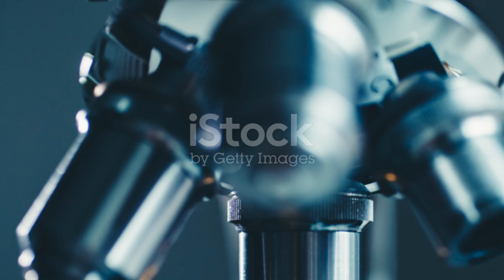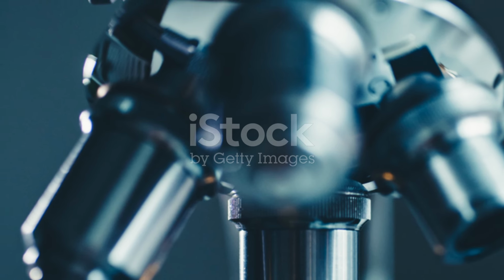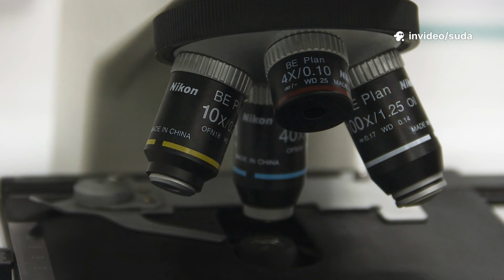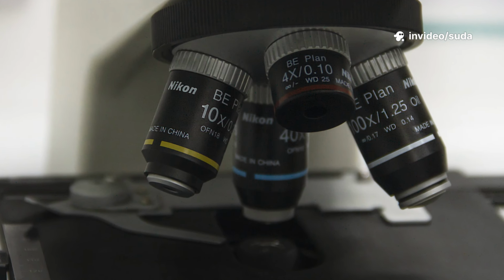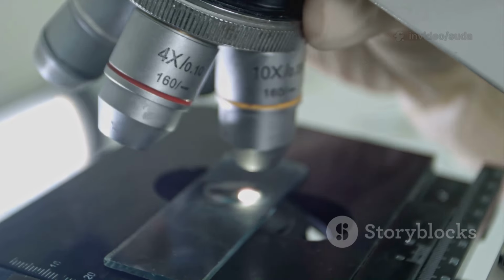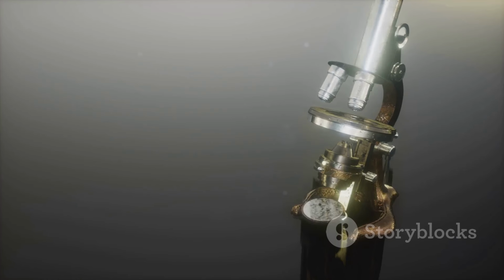Low power is a wide view, like a whole map. High power is extreme detail, like one street. Eyepiece times objective equals total magnification. The stage is the flat platform where you place the slide. Clips hold it securely. Below is the light source, shining through the specimen.